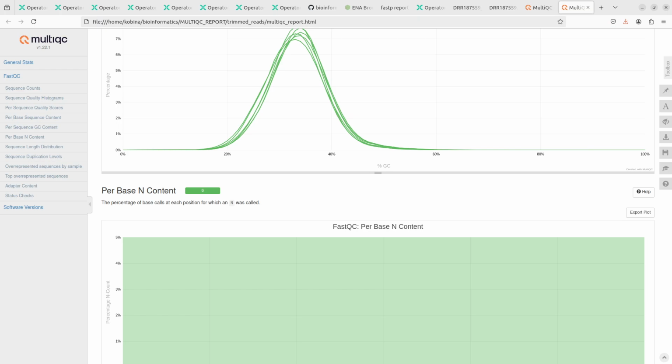So this is the end of this tutorial. This is for trimming, and subsequently we are going to update the script and then use it to do mapping and probably RNA analysis and so on. So this is to serve as a guide, and then later you can also contact me, especially those who want more tutorials on Nextflow.